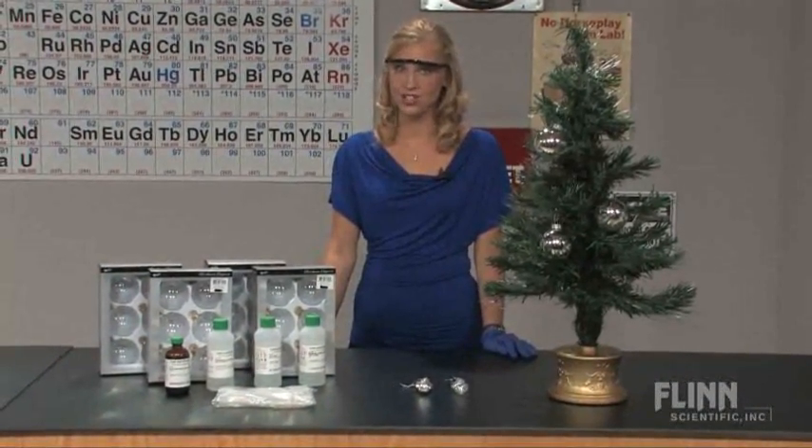Who says you can't do chemistry during the holidays? Create striking silver ornaments with your class as an application of an oxidation-reduction reaction.